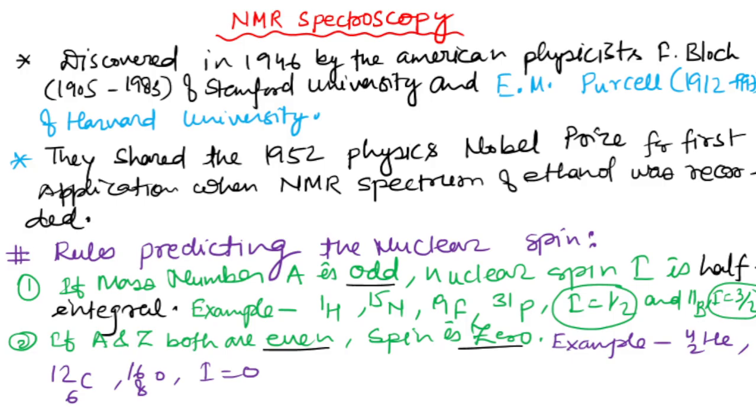So today I'm going to discuss NMR spectroscopy. In this video I will cover NMR spectroscopy and its discovery, rules for predicting nuclear spins, and the role of magnetic fields versus energy levels. And last, I will discuss chemical shifts. So let's start.